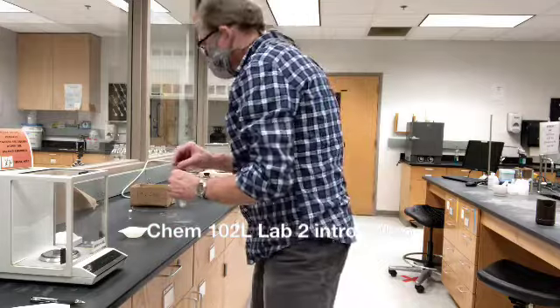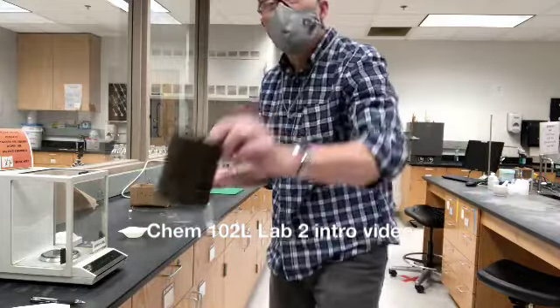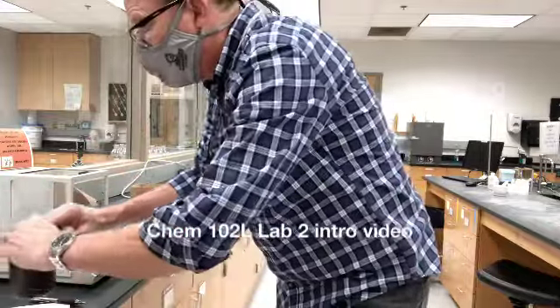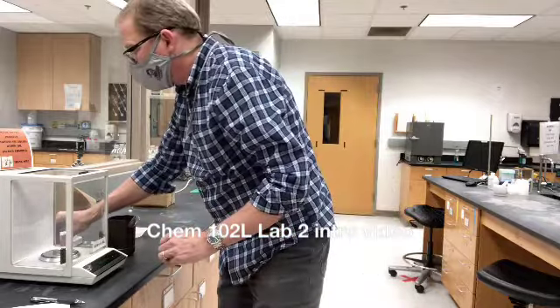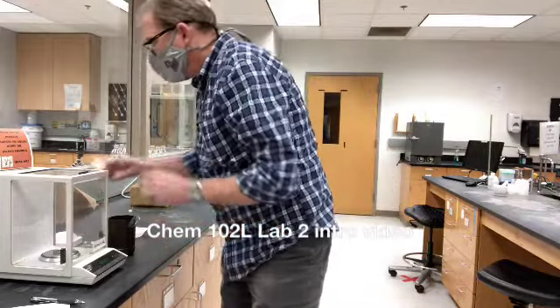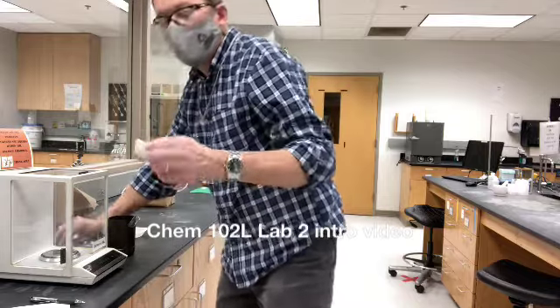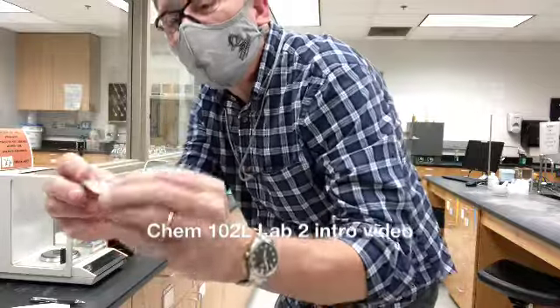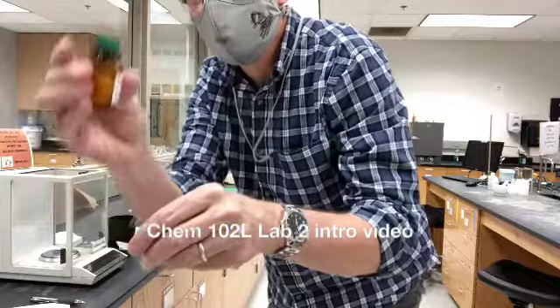So I'm going to grab my test tube support so it doesn't fall over and leak lauric acid all over the place. So that's setting right here. And I'm going to take a smaller boat. This weighing boat is a smaller one. It's just as flexible. And in here, I'm going to try to measure out 0.8 grams of this unknown.